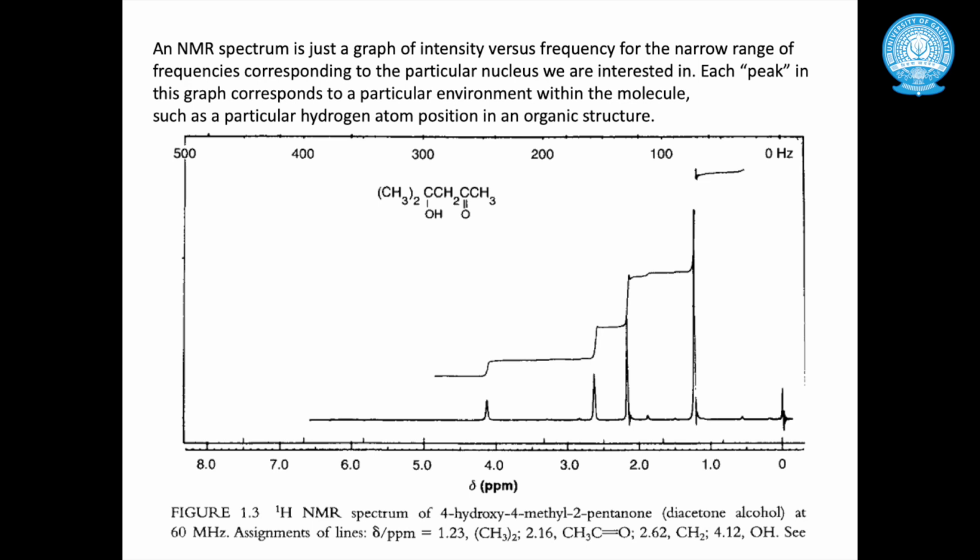Of course, for an unknown compound, one has to do a lot of hard work to decode the structure. This is for a simple compound, but not every biological compound is as simple as this. When there is a complex compound with multiple substitutions and multiple shielding effects working, we will have a tough time elucidating the structure.